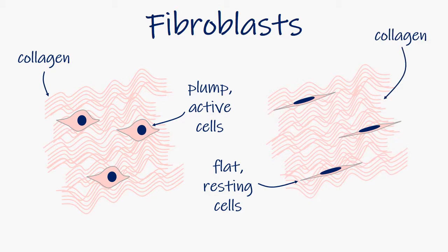Just before we look at an example of a light micrograph of this, you should take note that although the initial steps of collagen formation occur inside the fibroblast cells, assembly of collagen happens outside of the cells. Collagen is an extracellular protein. It is too large to be assembled inside cells. This explains why there is so much eosinophilia between the fibroblast nuclei in connective tissues. The eosinophilia is not the cytoplasm of the fibroblasts, but is rather large expanses of extracellular collagen.